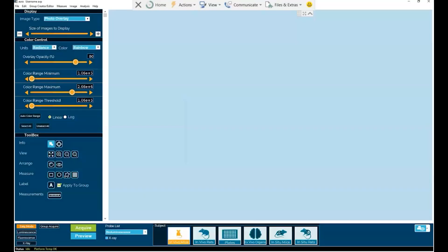Welcome to SI Imaging. In our latest software release, ORA 4.0, there are some very exciting new features, and that is the subject of this overview tutorial.